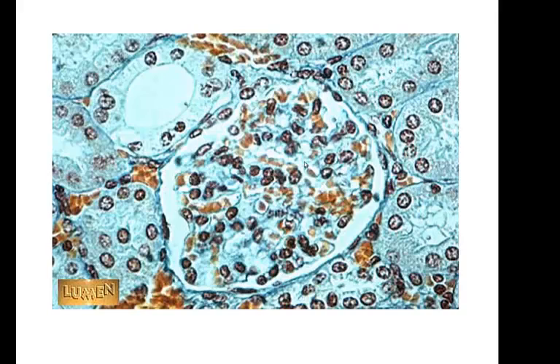Now, if you look at this picture and try to find simple squamous cells, I'm going to give you a second before I point to them. Try to locate a simple squamous cell on the slide. Can you do it? They're lining a structure. Here they are, right here. This is the nucleus to one, and it extends on around, and here's the nucleus to another. It extends on around, here's the nucleus, and it keeps on going.